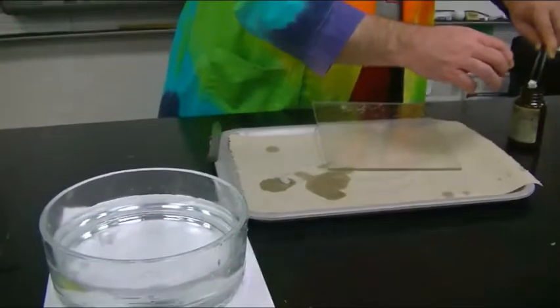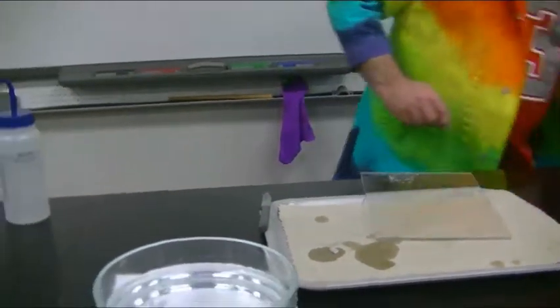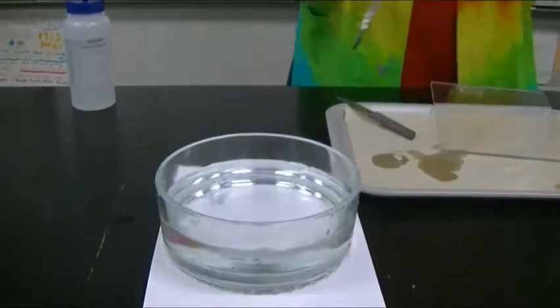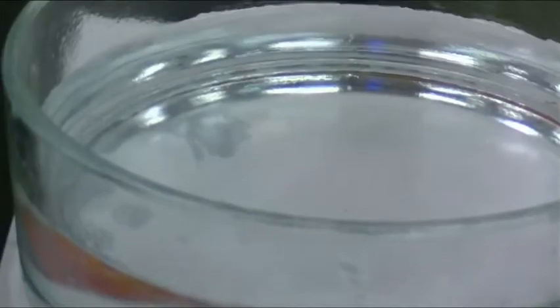So let's put the other first piece, what's left, back into our mineral oil. We don't want to have too much trouble with that. And let's take our piece of sodium in here. Again, we're going to use our little blast shield. Let's go ahead and fry this turkey.